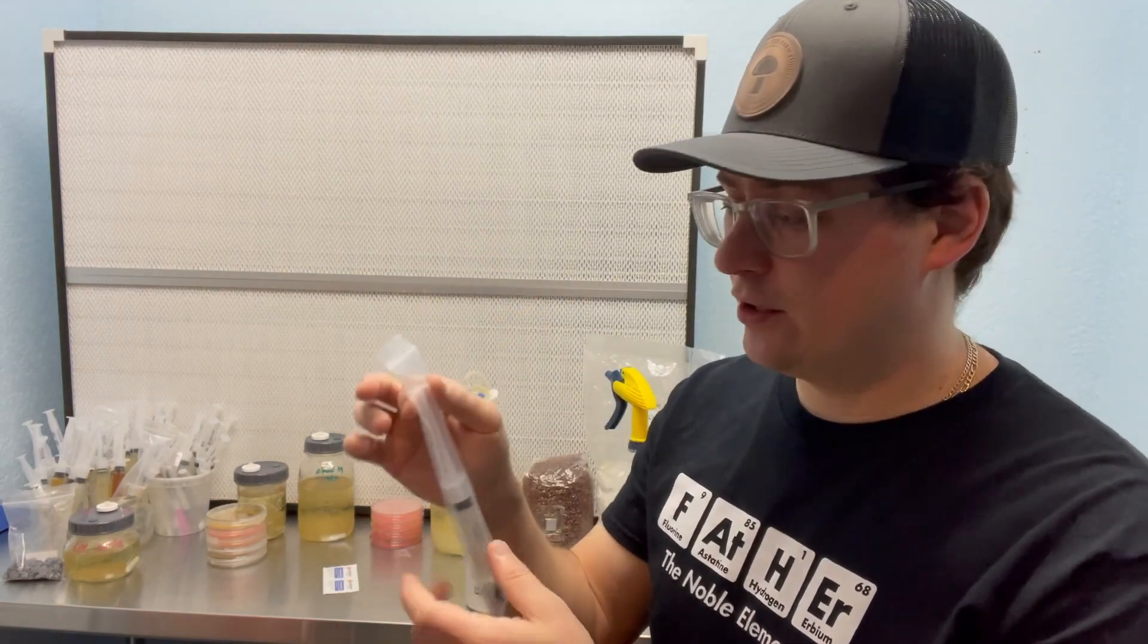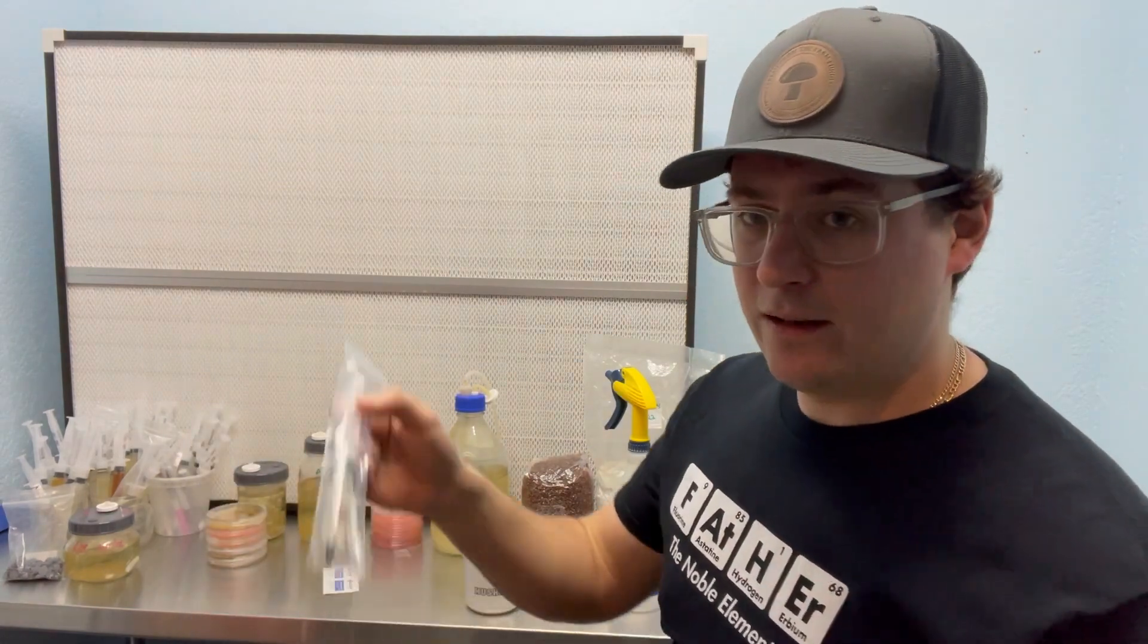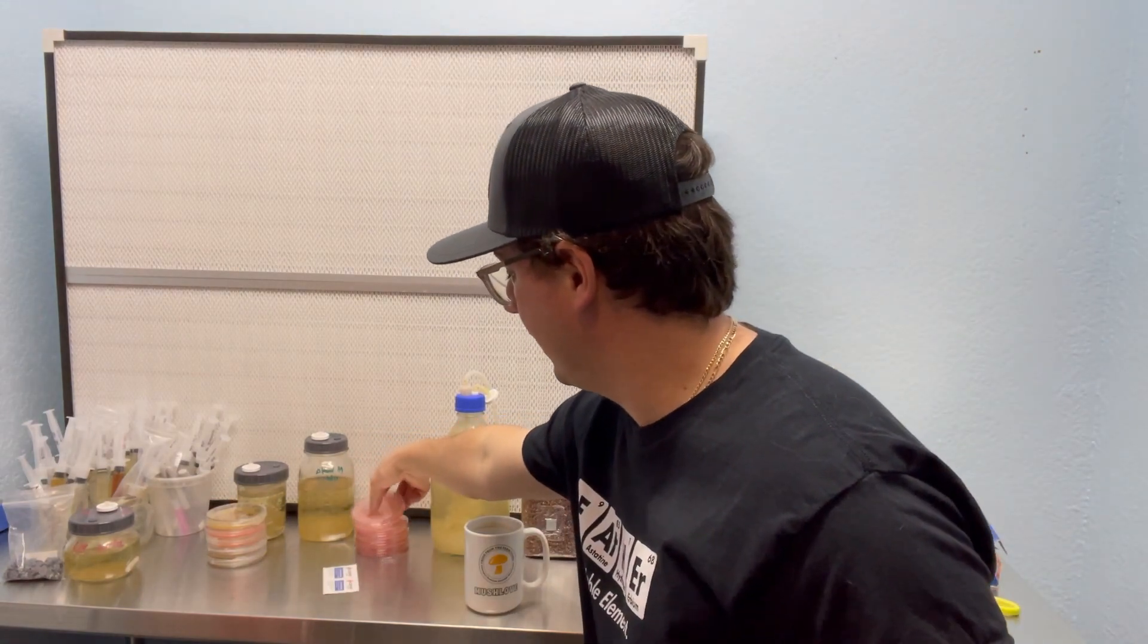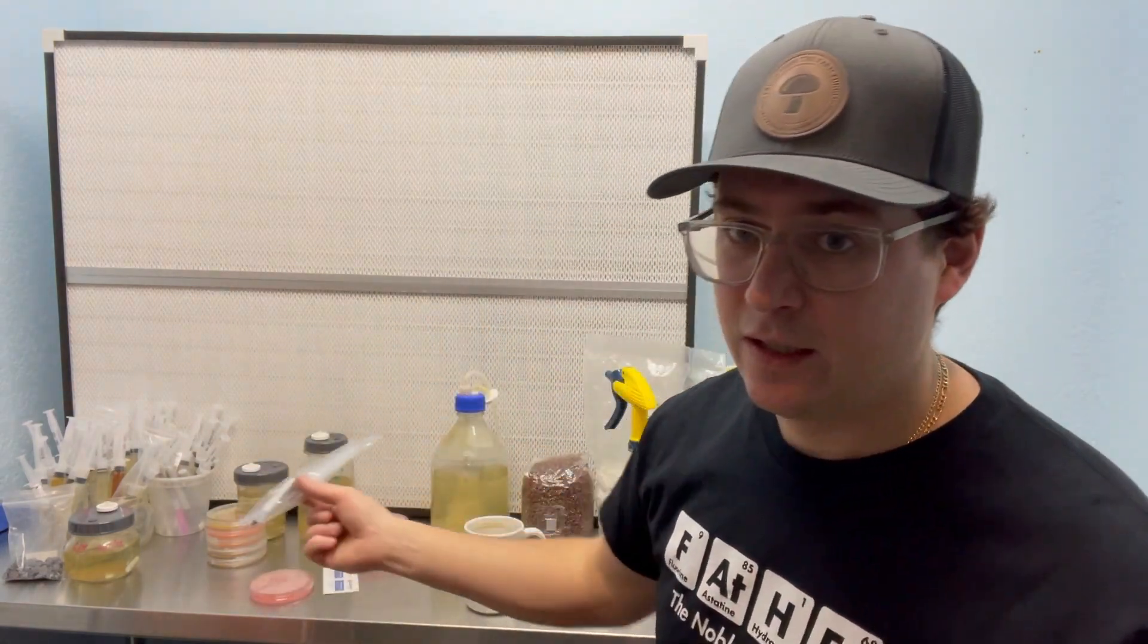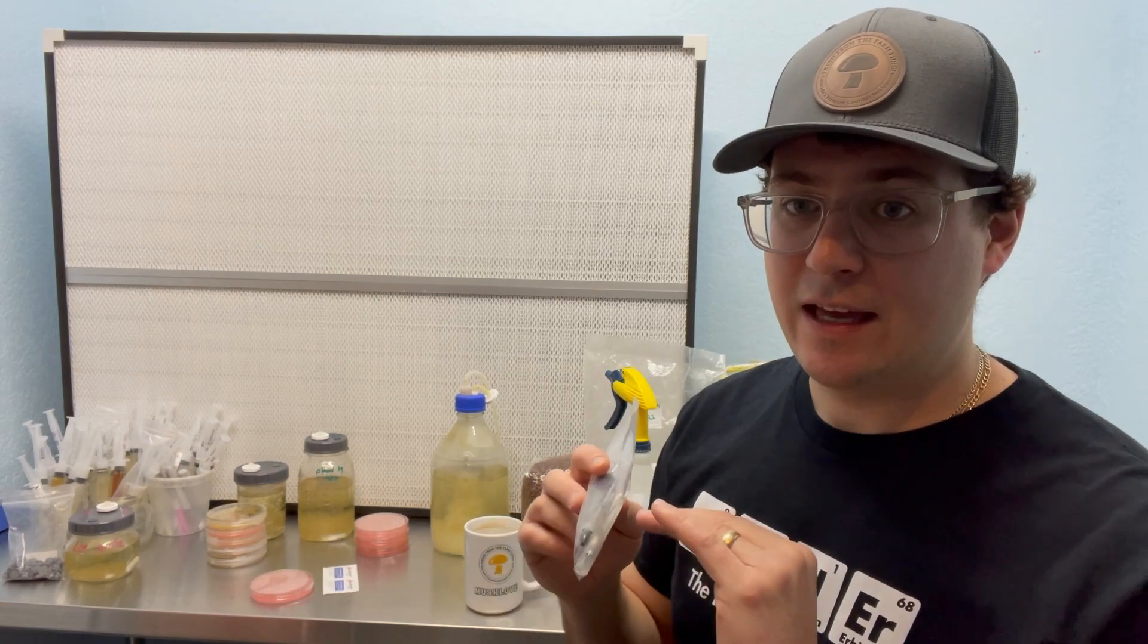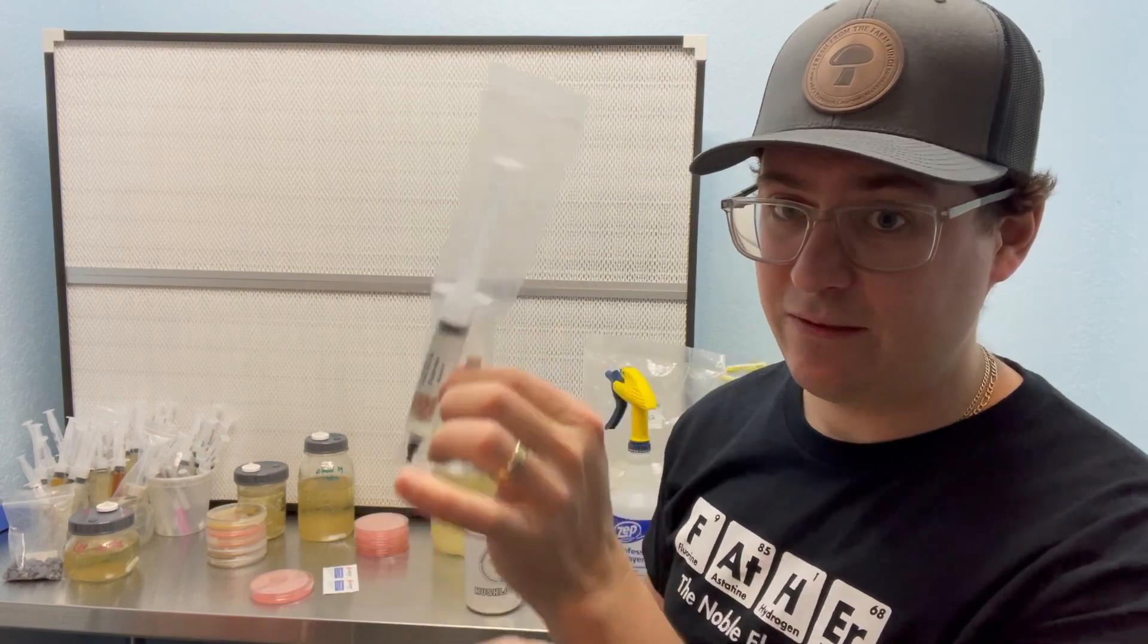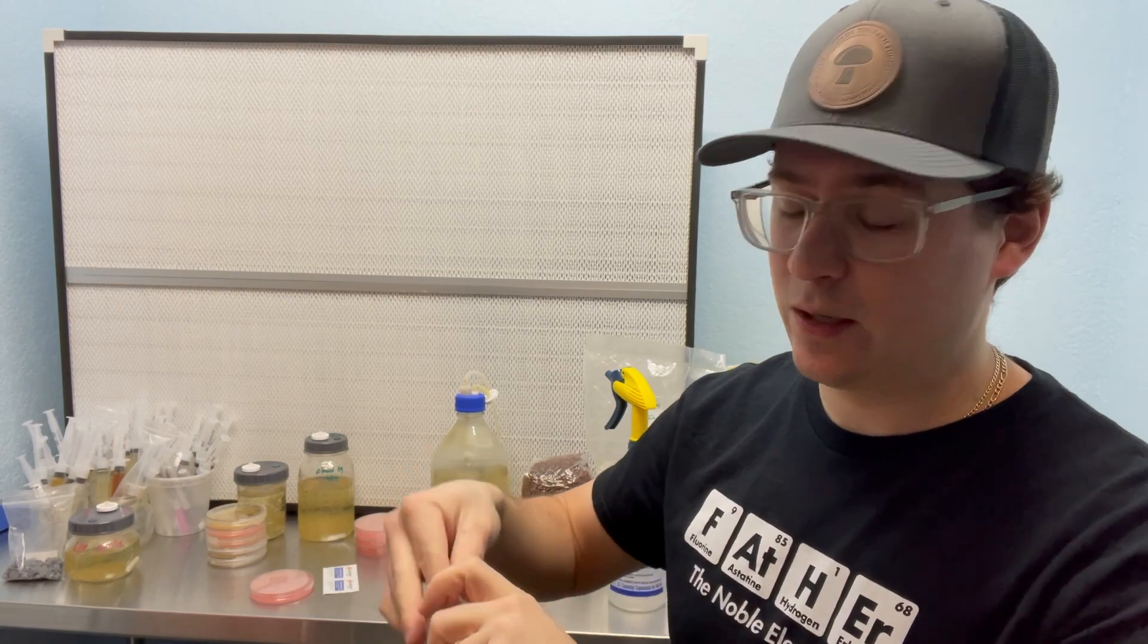When you have your liquid culture and your workstation is set up, you can either inoculate a petri dish, which is a growing medium for mushrooms. So this is a malt extract agar petri dish. And you can put a couple drops on the petri dish while making sure that you don't touch that needle. So that's the most important part receiving and using this liquid culture is to not touch the sterile needle. So I'll show you how to do that really quickly.